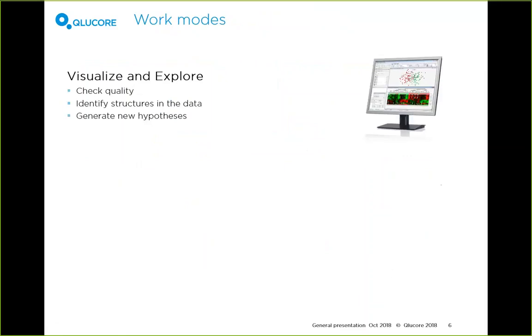And what we tend to talk about when we talk about analyzing data, we want to emphasize exploration of data. In the exploratory phase, we start looking for patterns. You start looking for groups of samples that belong together and so on. Then you go on checking the quality of your exploration, for example, doing statistical tests on that, and generate new hypotheses for further research.